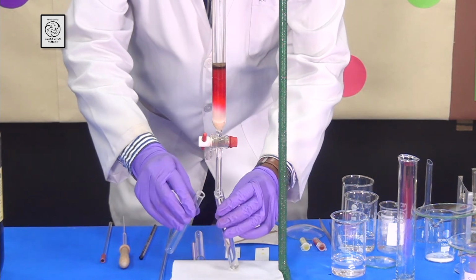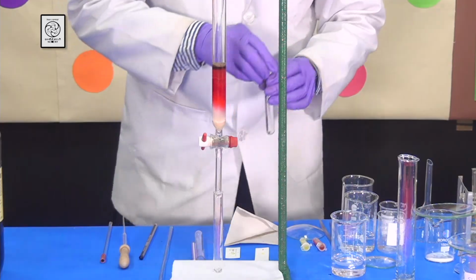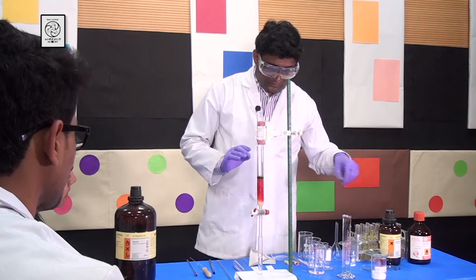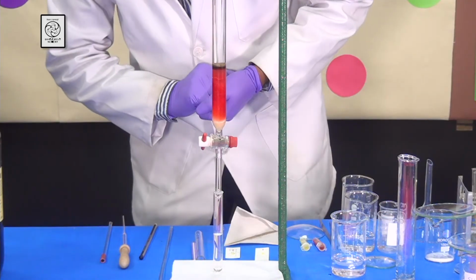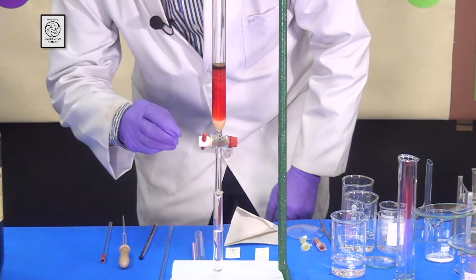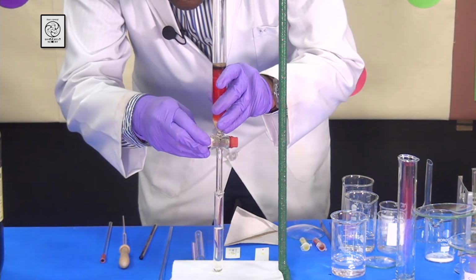I am going to change the test tube. Now, you can see that the yellow compound is completely eluted and the solution is colorless. Now, as I increase the polarity, you can see that my red compound has slowly started moving. I can increase the speed of the column by opening the stopcock a little bit more.